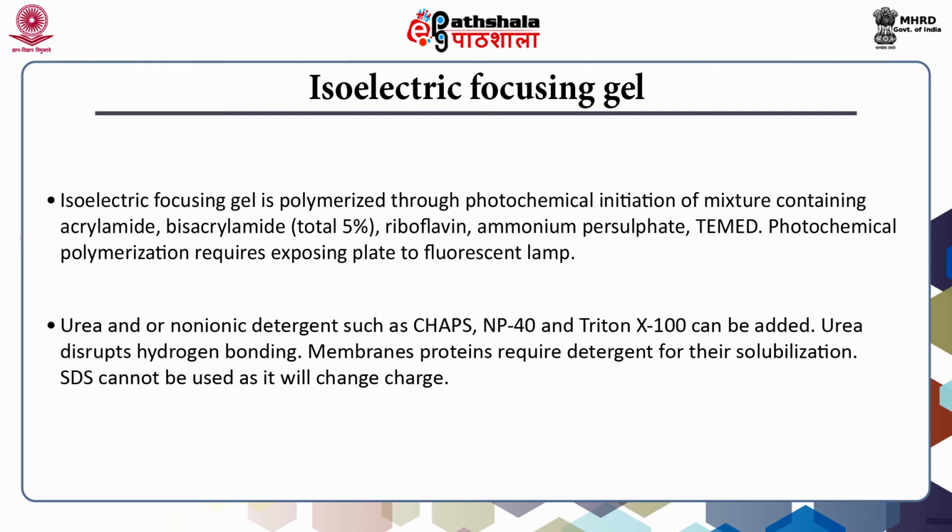Acrylamide concentration is usually kept around 5%. Urea and or non-ionic detergent such as CHAPS, NP40, Triton X100 can also be added in need-based situations.